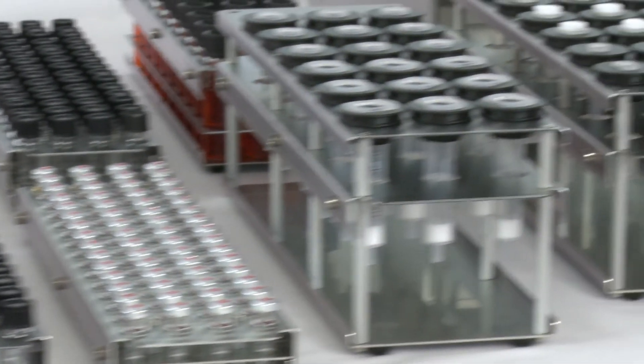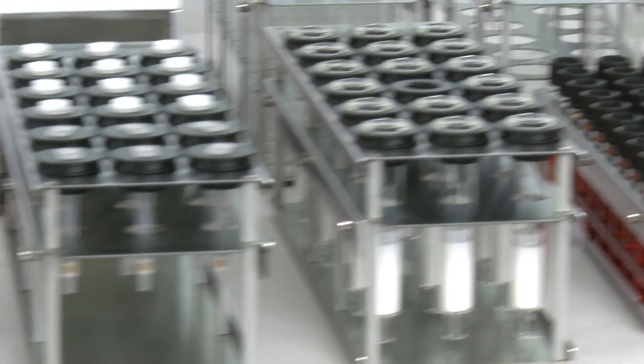More than 40 different racks can be freely combined in the Freestyle system at any time, each rack with different sample containers.